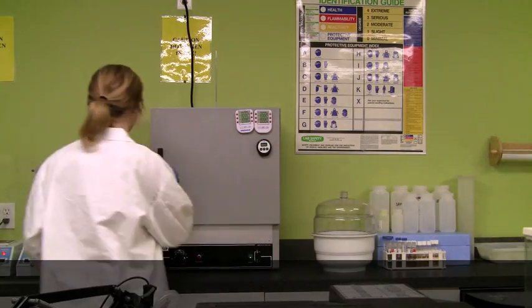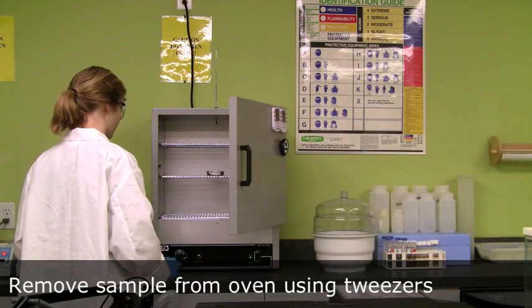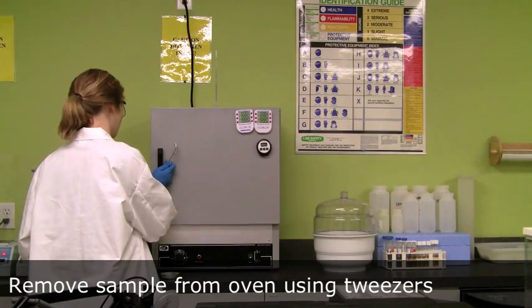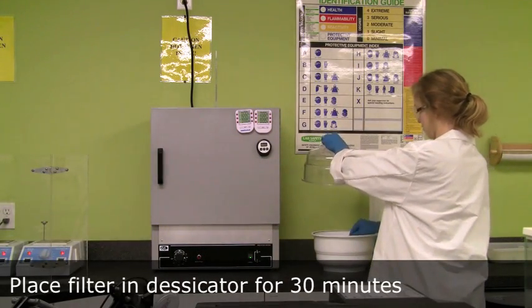After an hour, remove the sample from the oven using tweezers and place the dish in the desiccator for 30 minutes. The desiccator allows the filter to cool in a moisture-free environment.